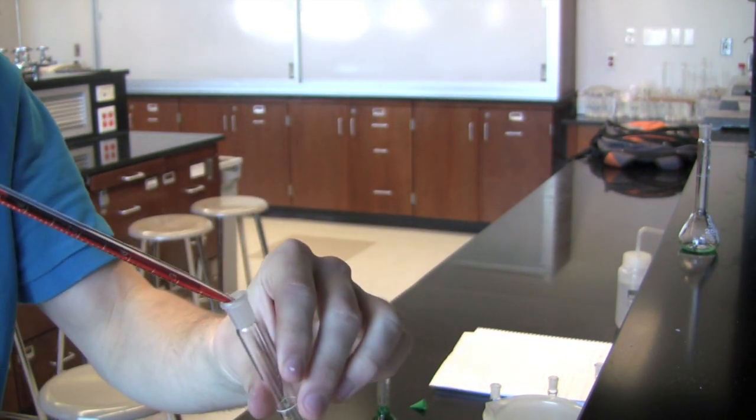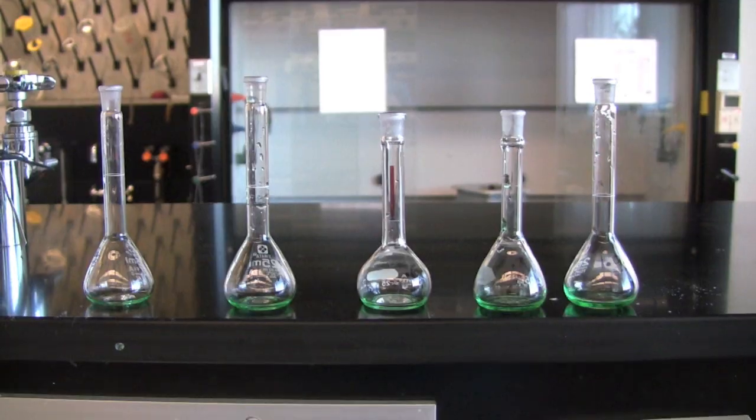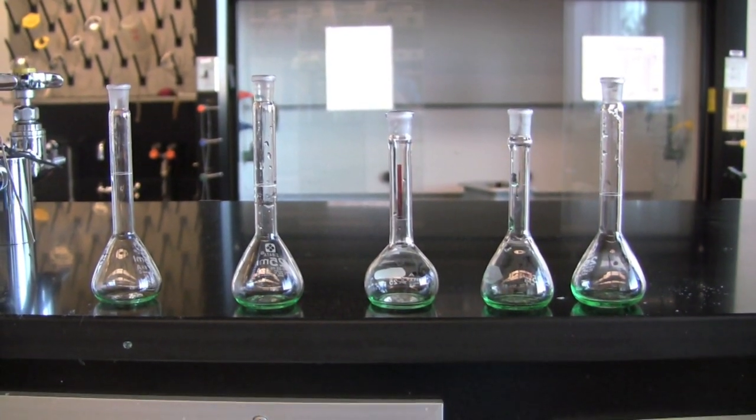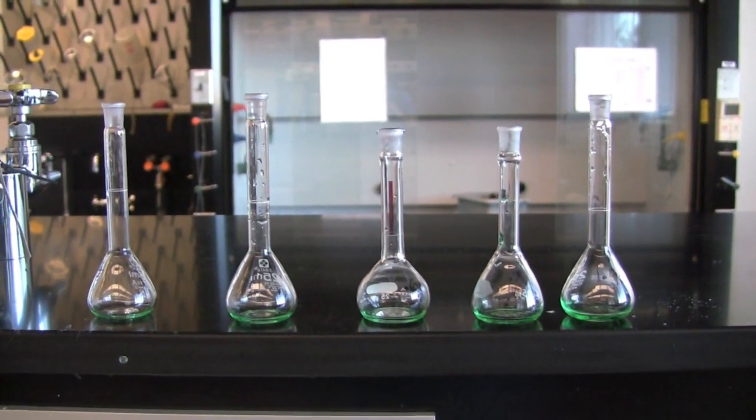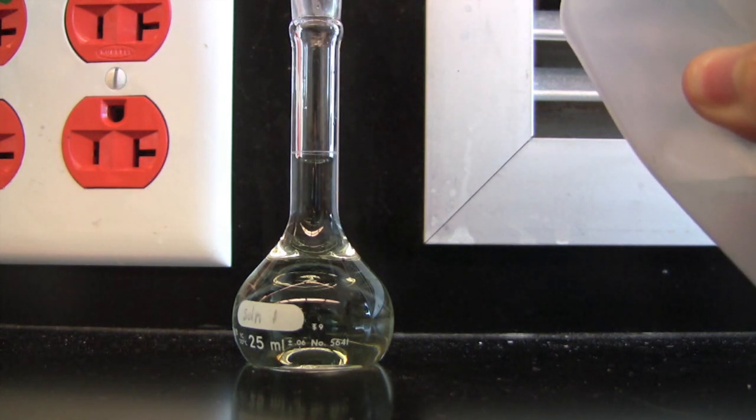After the volumetric flasks have been completely filled with each appropriate solution, begin adding water until each volumetric flask reaches the 25 milliliter line located at the center of the volumetric flask.